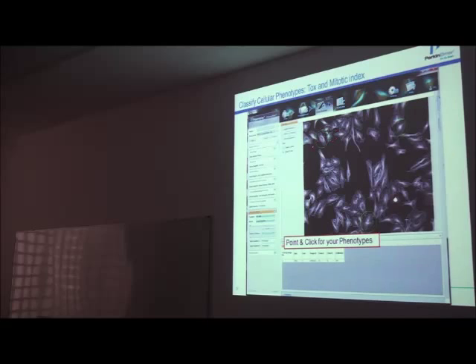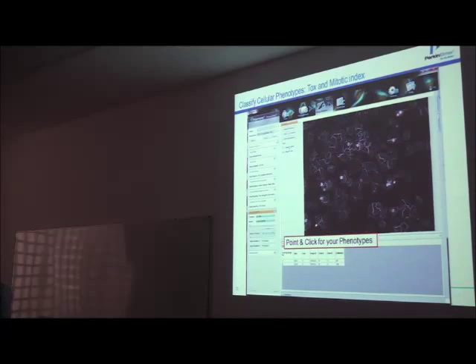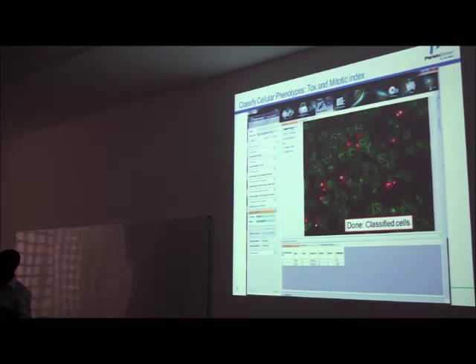And then you just choose a few examples of A and a few examples of B. This is the green circle here. This is A, take 1, 2, 3, large one, small one, and we see the B. Right? If you don't have enough objects in B, for instance, and you have to look at here, this is well B15, you can move to a different well. And then you take some examples, 1 and 2. This is well B19. And if you click next, the software will automatically classify these cells based on the properties which have been calculated before for each population.